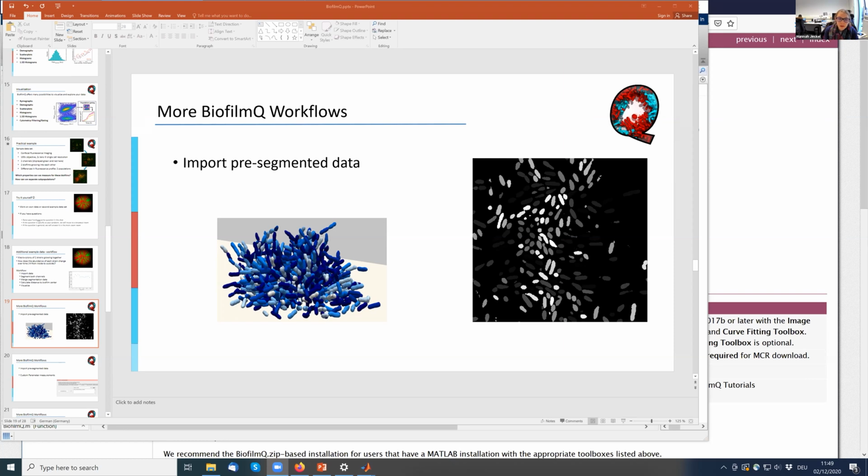So be sure to contact us about that. That's also something Philip just mentioned: not everything happens from the start, and BiofilmQ is still a work in progress. We are PhD students trying to get good software out there, and obviously it has its flaws.